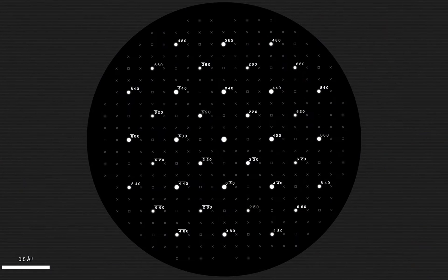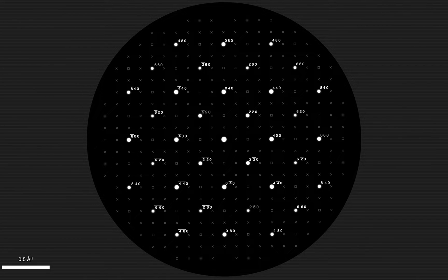Welcome to Single Crystal 4. In this tutorial we're going to create a new crystal structure and simulate its diffraction properties. We'll then use the inspector to change the display and we'll edit the structure interactively to see how the diffraction pattern changes.